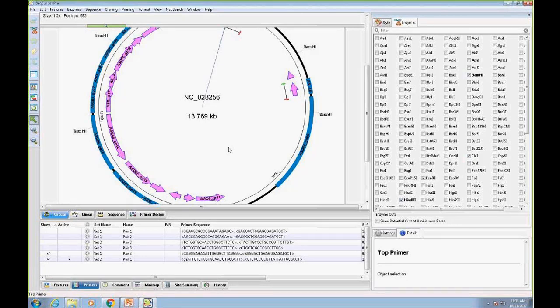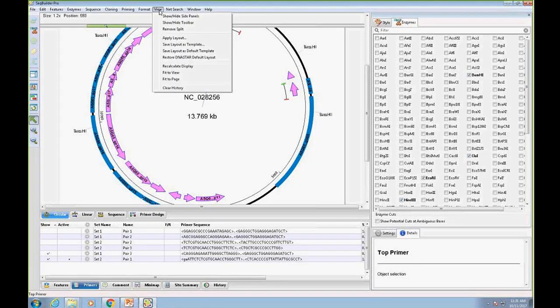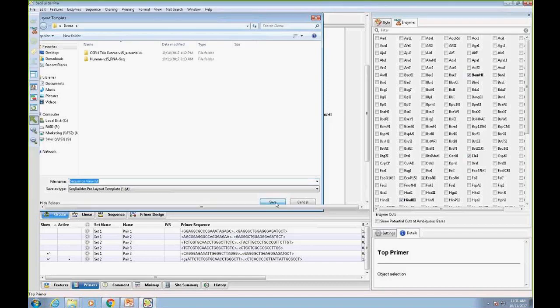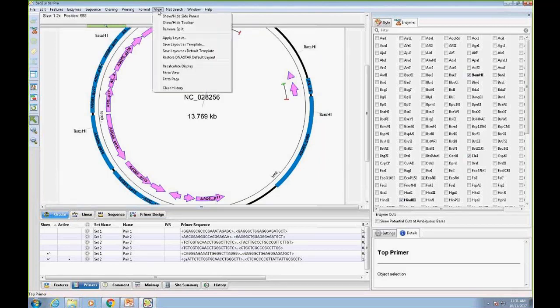Regarding whether you can create additional layout files: yes. Under the View menu you can save extra layouts as templates — for example, a special layout for sequence view — and apply them later by locating the file. Long-term customers may already be familiar with this flexibility.